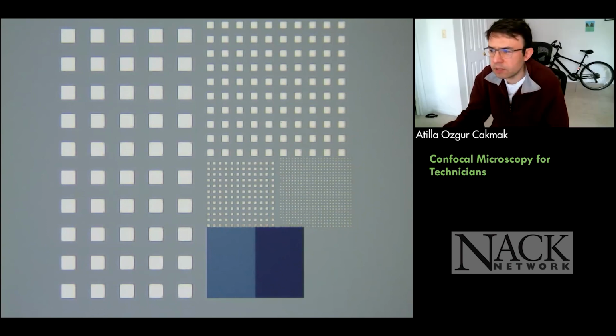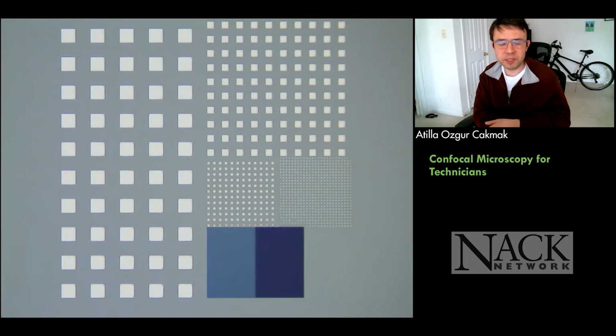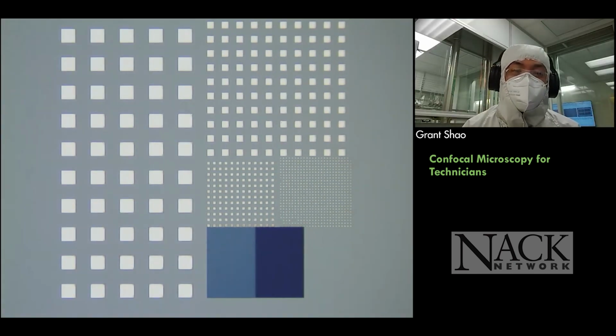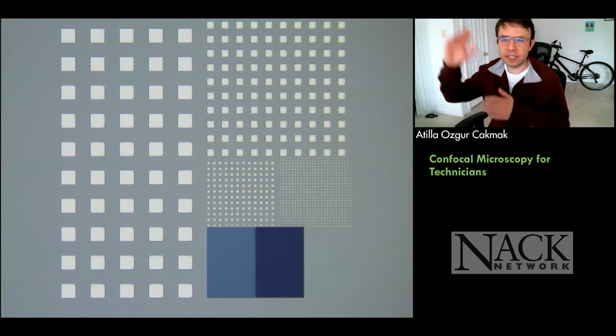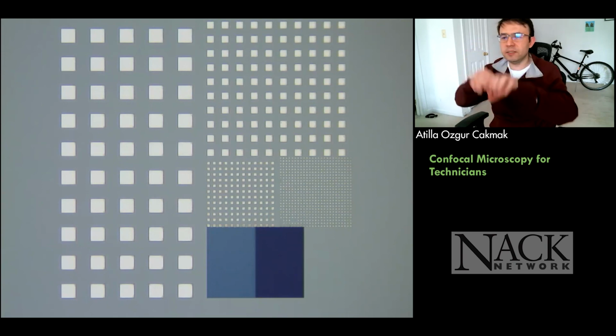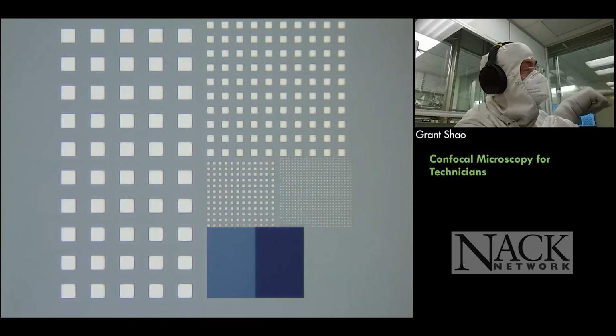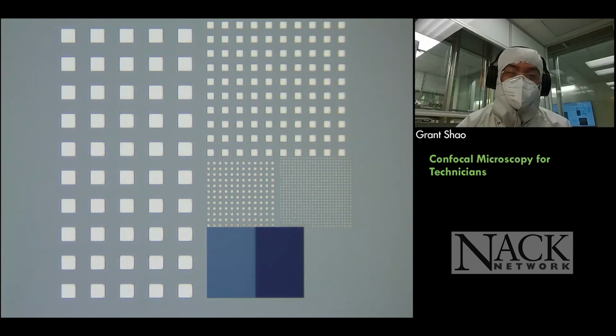And we also had a question from Abdallah. Again, the one that you've just shown here, these grids, is that a mask layout by any chance? So I patterned this with electron beam lithography, rather than a hard mask. So this isn't like a stamp, right? Yeah. It was directly written on the resist. And then I deposited aluminum on top and then did a lift-off. I see. Okay, gotcha.